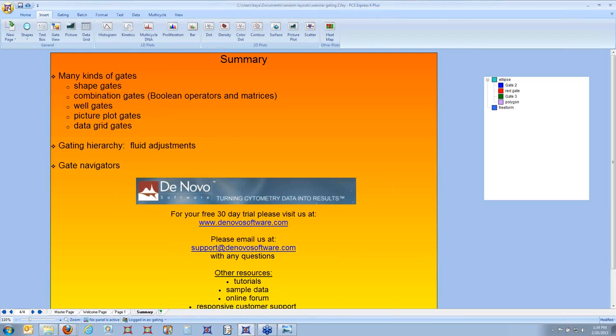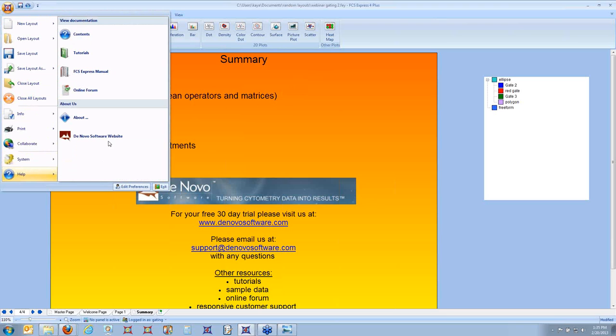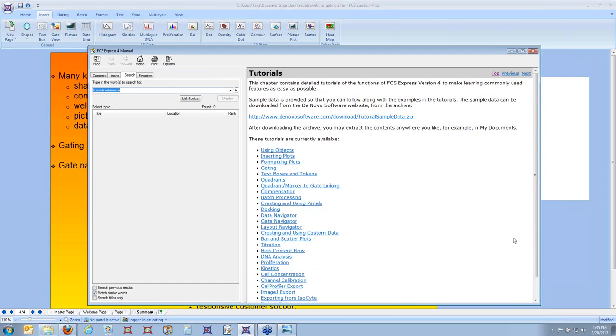I also want to point out that all of the stuff that I covered today is available in our tutorials. So if you have the program open, you can just come up to the Applications button, come down to Help, go to our tutorials, okay? And basically we have tutorials on lots of different topics. So here's the gating one. Everything I talked about today is right here in the gating one.